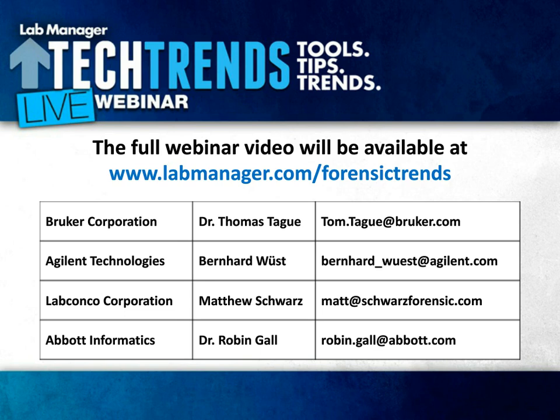Yeah. Thank you. Okay, thank you. Now, Matt, is it common to put a lot of evidence in the chamber for batch processing, or is it more common to process evidence one piece at a time? A lot of that's agency specific, but I argue when we go into labs and help them with workflows and designing their systems to batch process.